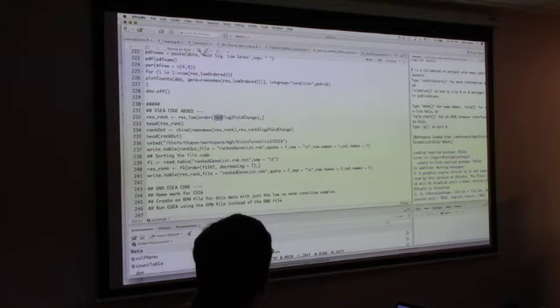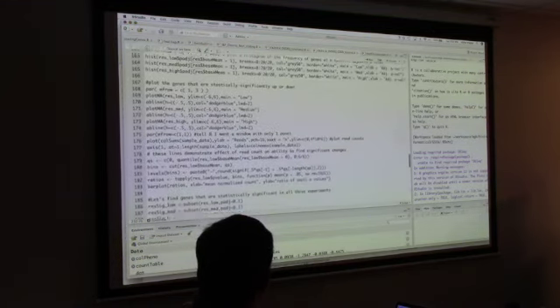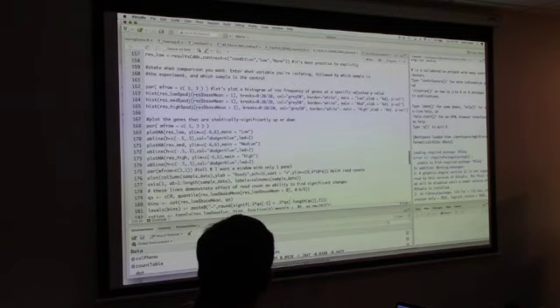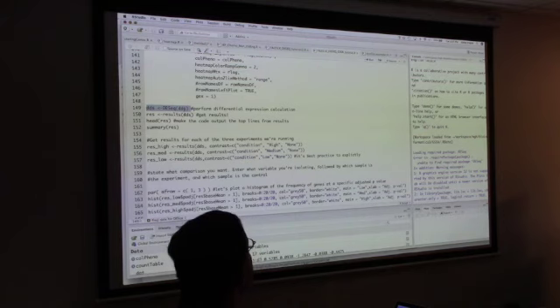So this object, if you go up, you can scroll up. The res object is created all the way after your DESeq. So once you're done with DESeq, you create a results object, right? So this data frame contains your log2fold change and p-value for your results.